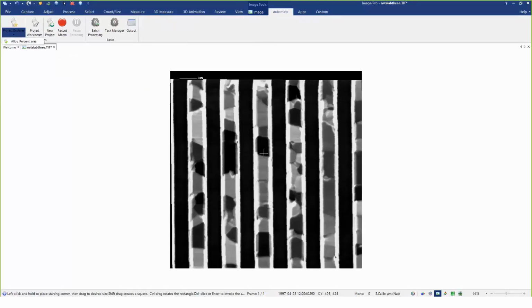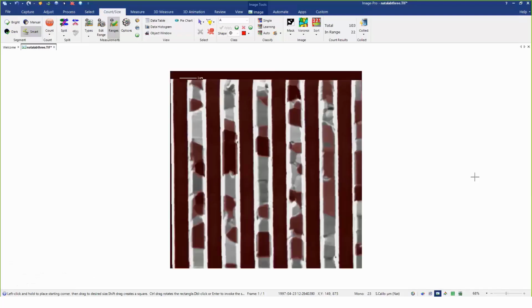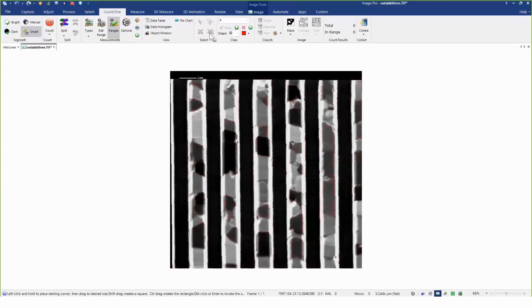And what we're looking for through these structures, and this is the EM image, you can see the calibration bar there, but it's simply measure an alloy within it. The problem in this particular one is, what I'm trying to measure matches the background. So normally to overcome this, we either position a series of ROIs and use Features Manager, or you can prompt someone to draw them. Again, depending upon the workflow and what needs to be done, but we want to add some interactivity to prompt them either to reposition ROIs or to draw ROIs so they're not counting the background.